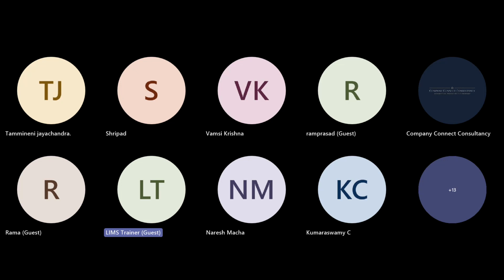In this course, I will teach you the SOP. For example, you worked in lab LIMS. There are certain fields which are in blue, right? Can you tell me what those blue fields are? Blue fields are mandatory fields, correct. But how can you make those mandatory?